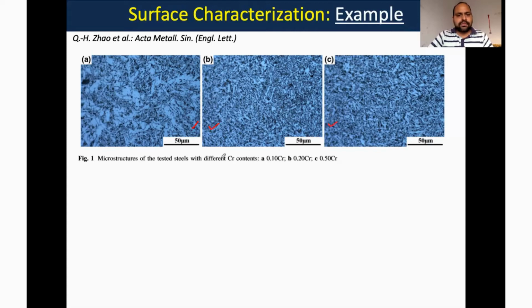There are differences in the microstructures if you look clearly, and even a difference in the distribution of the elements, the roughness, if you compare here with this one. Here it looks a little more uniform as compared to this. The phases here are not very uniform as compared to this sample and this sample.